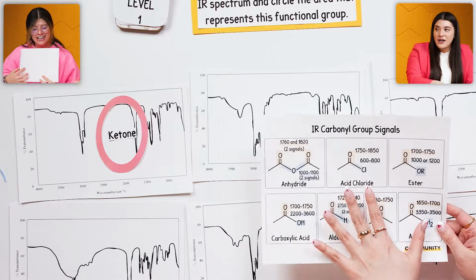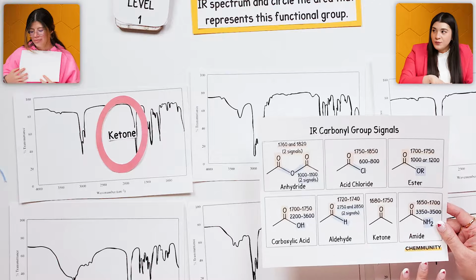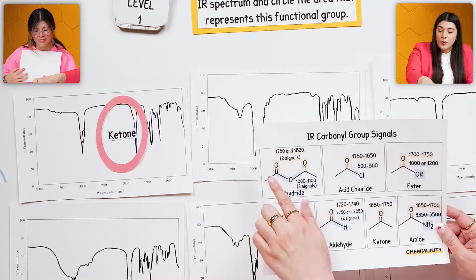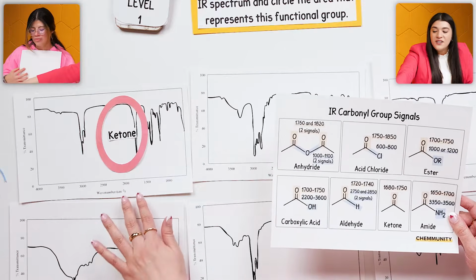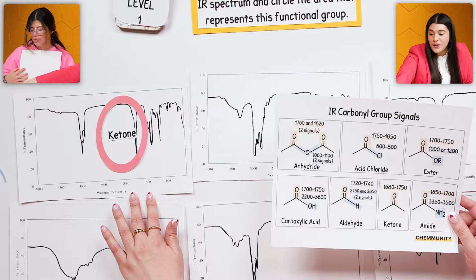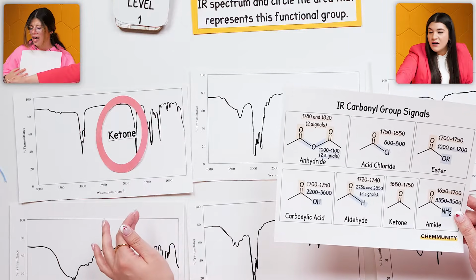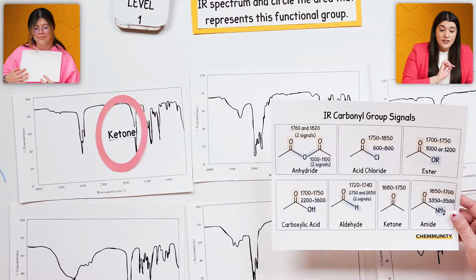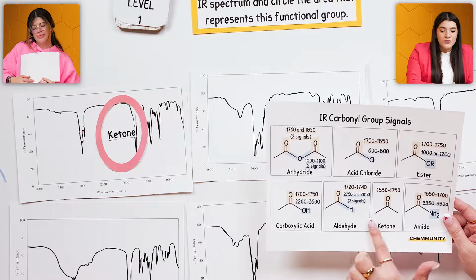So this is going to be a better guide here to be able to understand pretty much the different carbonyl groups, where for all of them, you'll notice the carbonyl portion of it is going to be within like 1700s. I know that this doesn't actually give you an exact number, but it's within that range. 1700 is probably roughly there. So that does tell me that is that peak that it shows me. Plus, for a ketone, there's only one peak. There are no other peaks.